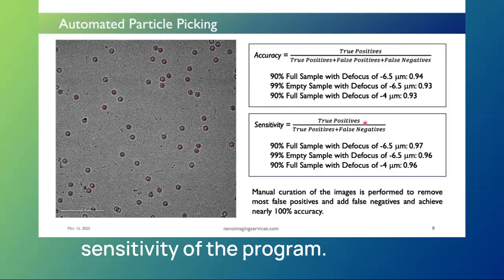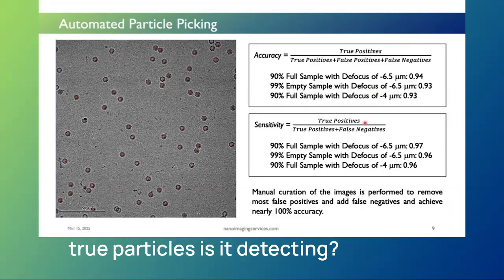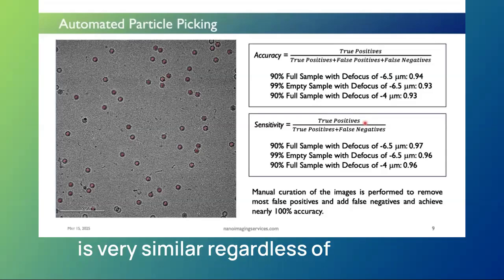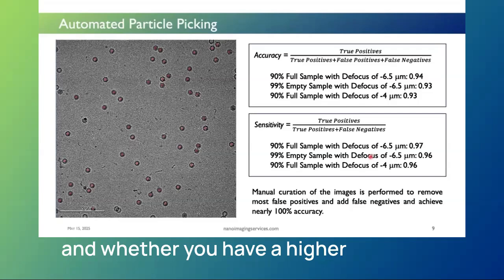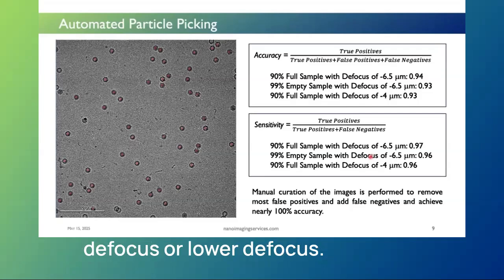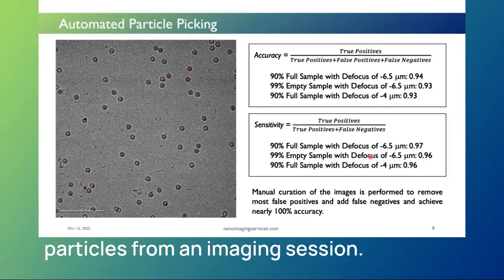We've also assessed the sensitivity of the program. In other words, how many of the true particles is it detecting? And again, the performance is very similar regardless of whether you're looking at full particles or empty particles, and whether you have a higher defocus or lower defocus. So this is a program that's able to generate a high quality set of particles from an imaging session.